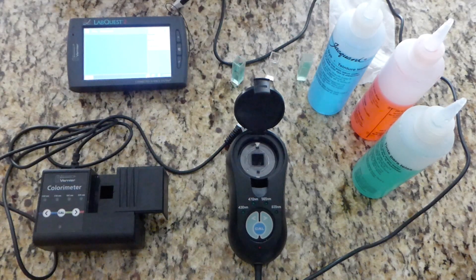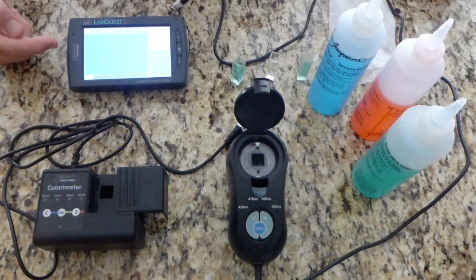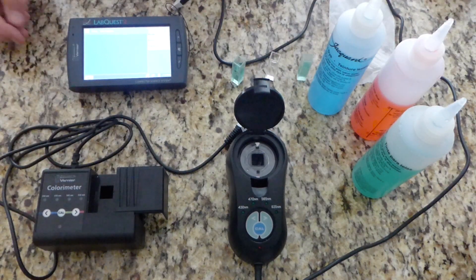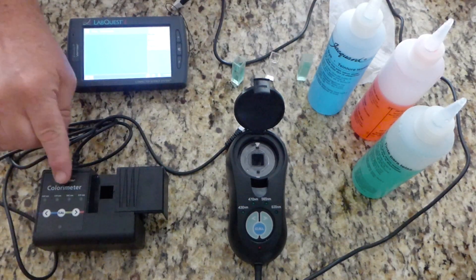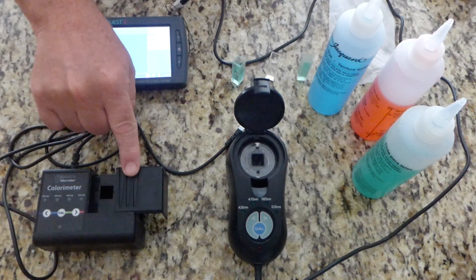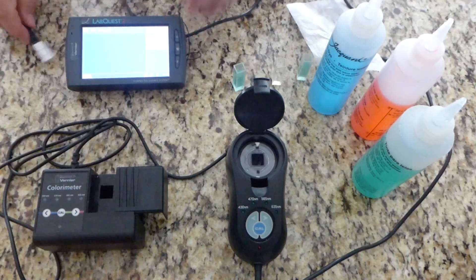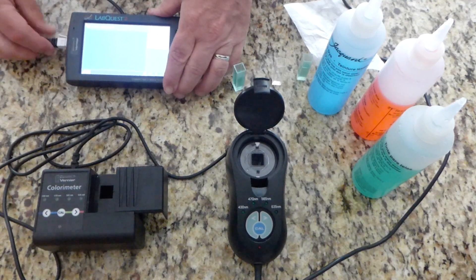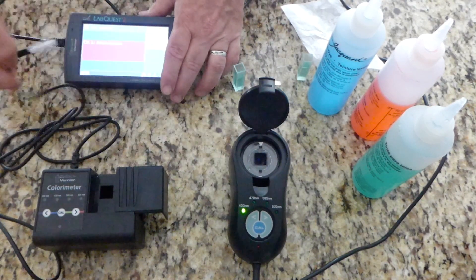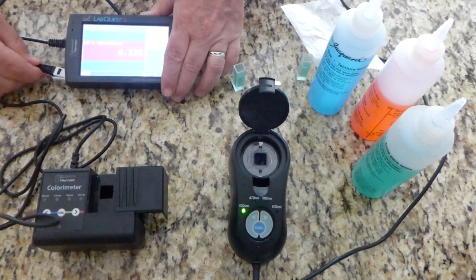Here you have a Vernier LabQuest and two different types of colorimeters. Both of them have a space to put a cuvette in. They both have four different wavelengths that they read at, a calibration button, and two selection buttons. To connect them, plug the cables in the side, and the machine automatically recognizes what you've plugged in.